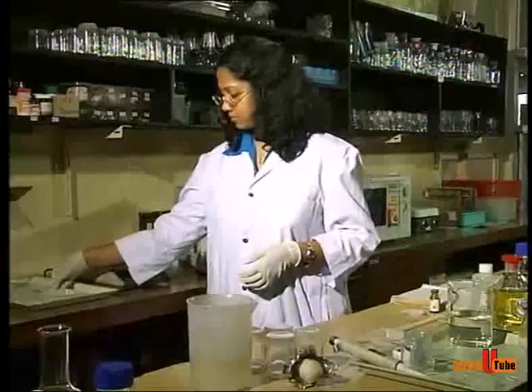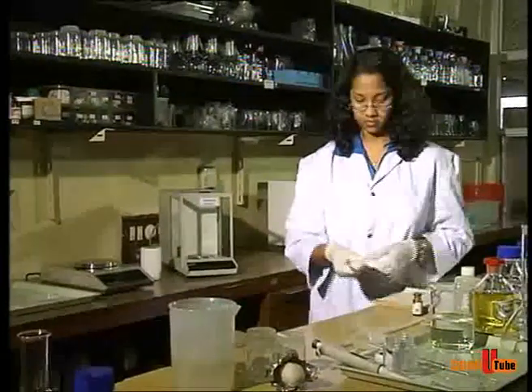The analytical balance is used to weigh minute quantities.